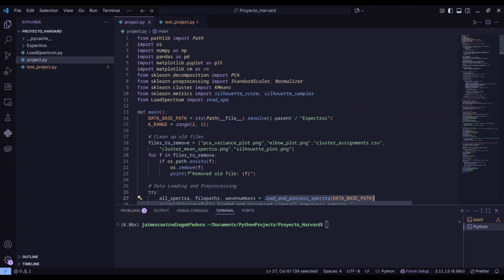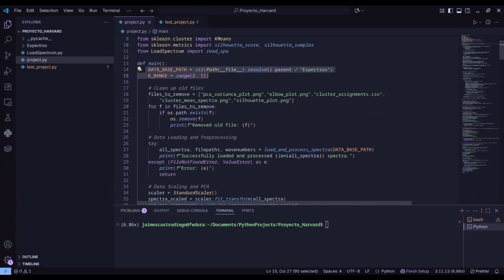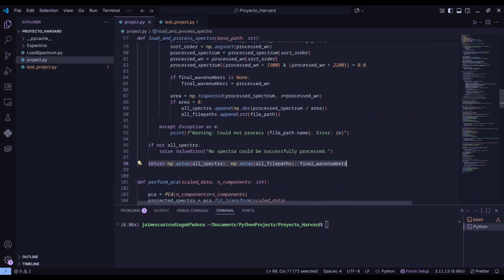Here I use NumPy, Pandas, and scikit-learn libraries. This script starts exactly here, by processing the entire folder of all data files available. If it goes through, this function would be called, and when that happens, the data received is converted into a two-dimensional NumPy array for all the mathematical operations that come next.